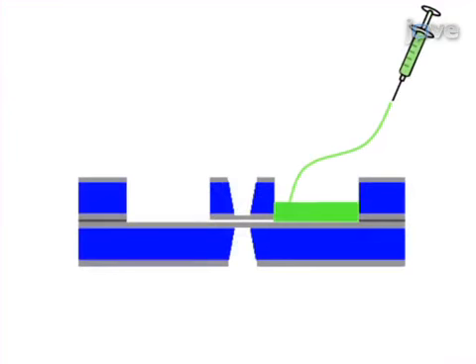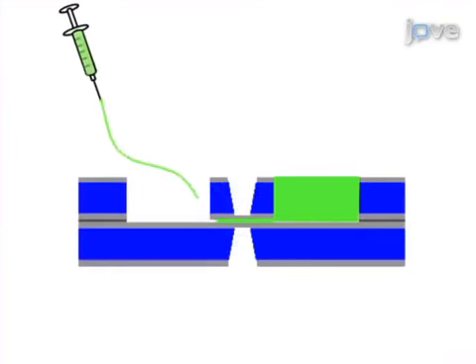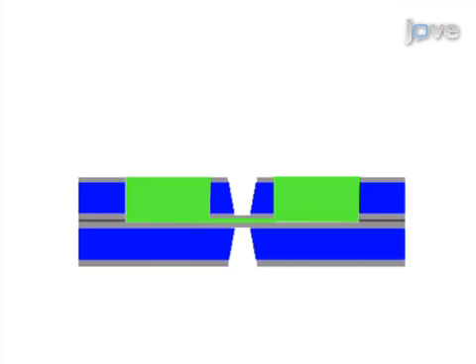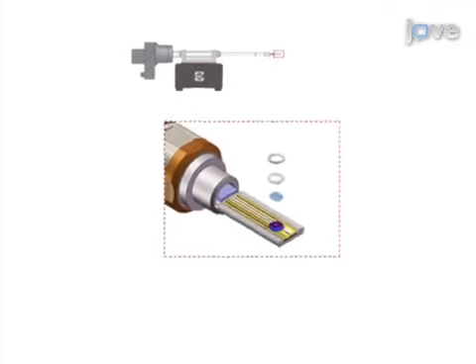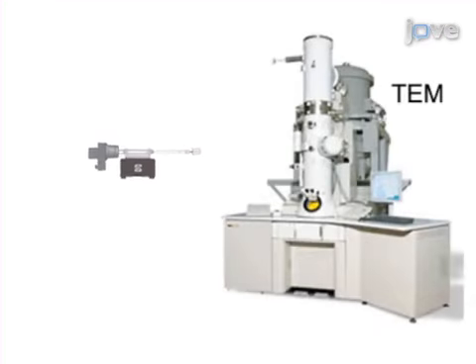As a second step, inject 100 nanoliters of reaction solution into the reservoir of the cell using a syringe and Teflon nanotubes. Then, seal the liquid cell with a cover. Next, load the liquid cell into the TEM sample holder as a standard TEM sample, and insert the sample holder into the microscope for in situ TEM experiments.